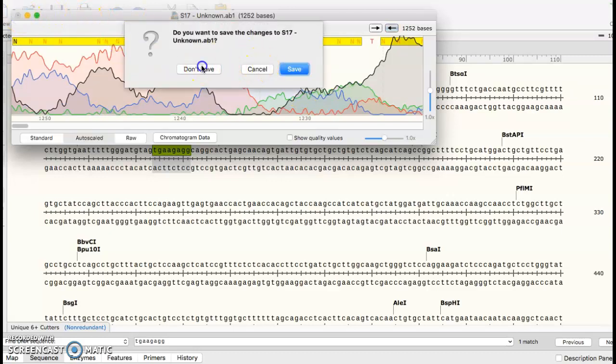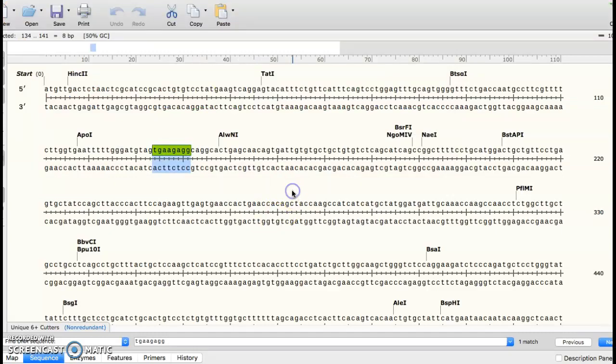But your first 100 bases or so that come after your primer are going to be kind of junk. So we want to give ourselves a buffer region. In English, what I'm saying is, if this is our region, I don't want to start right there with primer design. I want to start way back here somewhere, because all of this is going to get read out really noisy, and we're not going to get a clean sequence.